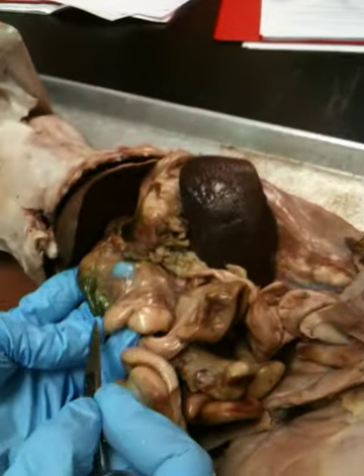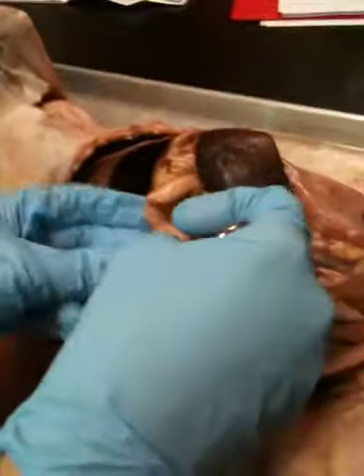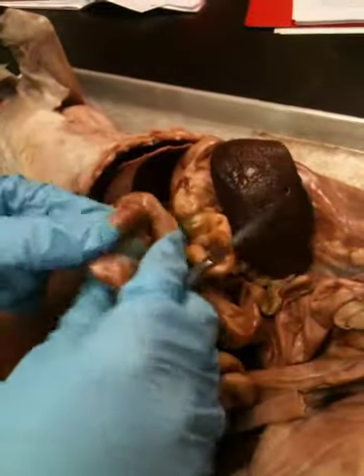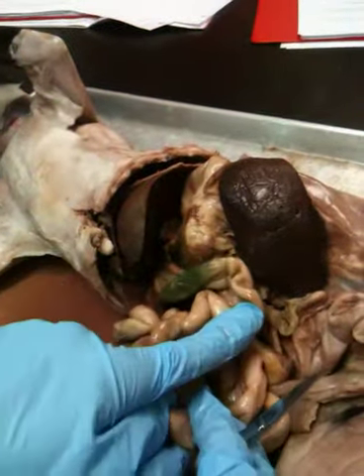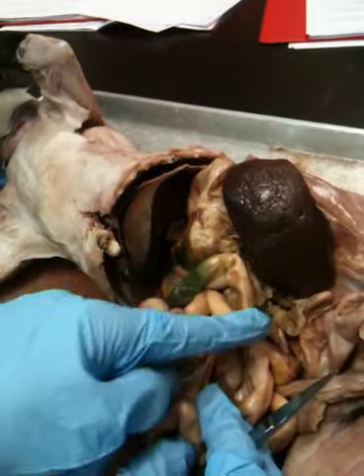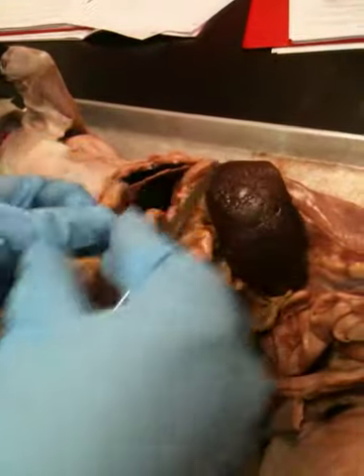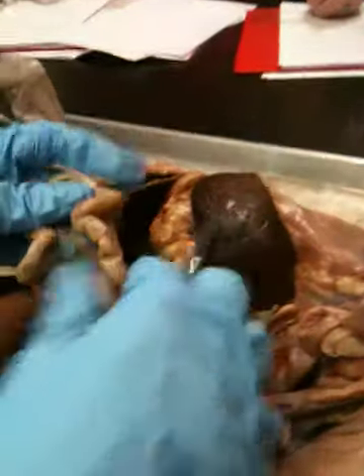And after the C, you can see the C ends, and now we get into these back and forth things, all this. So now we're in the second part of the small intestine. This is all jejunum. Now, you can't really tell where jejunum stops and ileum begins, so if I'm going to tag it, I'm going to tag it up here by the duodenum so that you have a reference point. But at some point, you would just change your name, and then I go, ileum. But there's no real way to tell where it is.